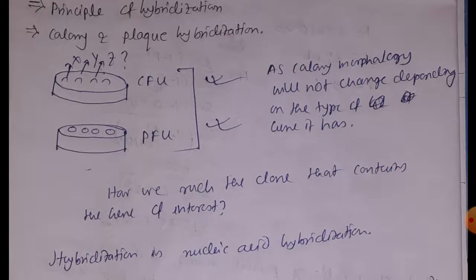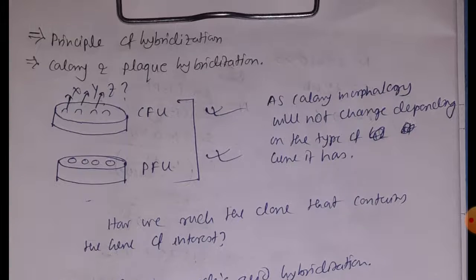An E. coli genomic DNA library, for example, is formed so that, suppose we want to study the LacZ gene, an important gene of the lac operon because it encodes beta-galactosidase. Then we have to go to the E. coli genomic DNA library to find the colonies which contain the LacZ gene containing cell.